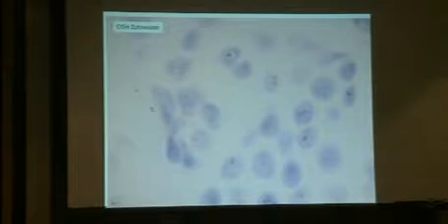So this is my proposition. Here you have some cells that you cannot score. It's all the cells with the blue cross, because you are not sure that you have one cell. I will show you here. Those cells, you are not sure that you have one cell. You may have some overlapping of nuclei.